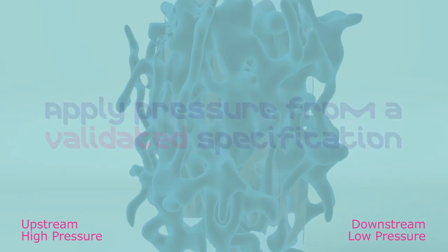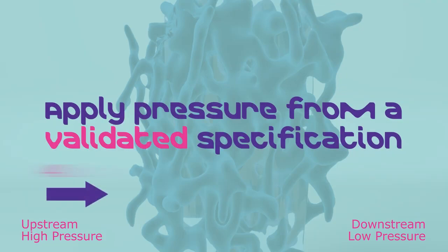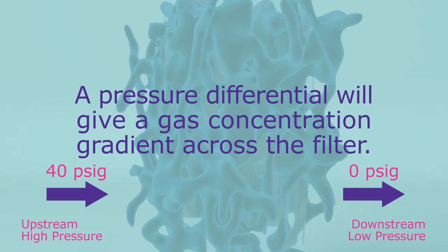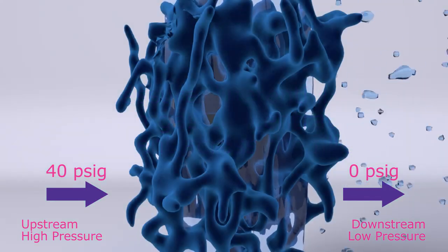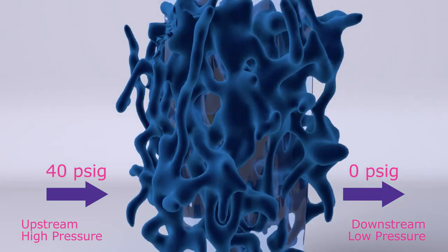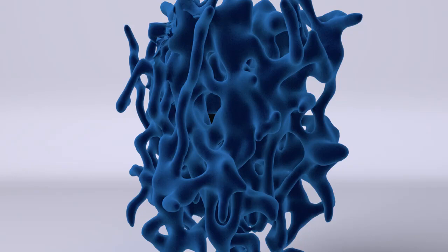On the downstream side, the pressure is lower, so the gas comes out of solution, resulting in a steady flow of gas. The rate of diffusive gas flow is very small compared to the flow seen when the bubble point is reached, but the larger the membrane area, the higher the diffusive gas flow. The diffusive flow with a syringe demonstration was much too small to see, so when I reached the bubble point, it was very clear. We went from seeing no airflow to seeing bubbles.